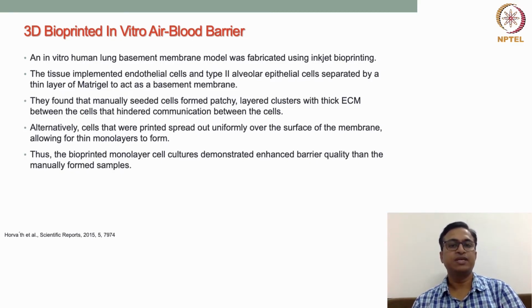In the printhead there are hundreds of nozzles lined up, so at a time we can generate hundreds of droplets. That's why this technology is a high throughput method for fabricating any particular structure. But a support structure or substrate is required to generate a 3D model.